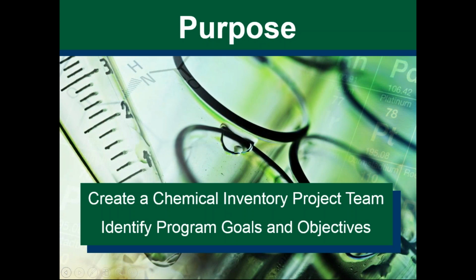So in identifying this, you want to create a chemical inventory project team. So it's usually a small group of people. It could just be you. It could be just one person managing the whole thing. But it's usually helpful to have a few people involved.